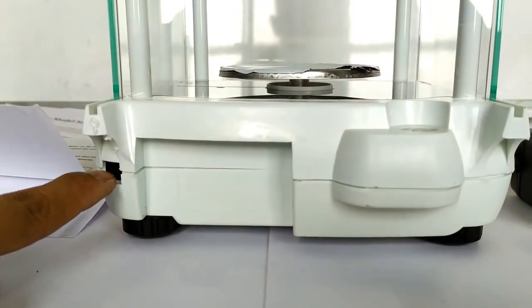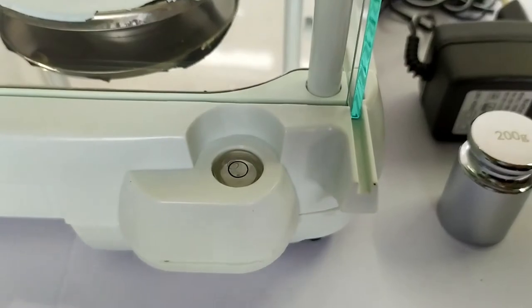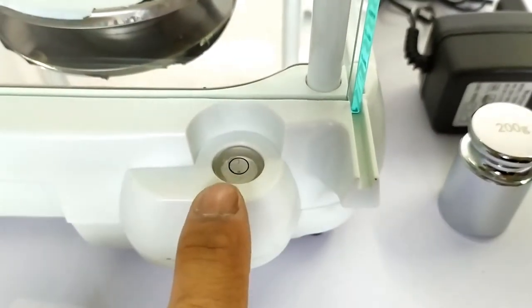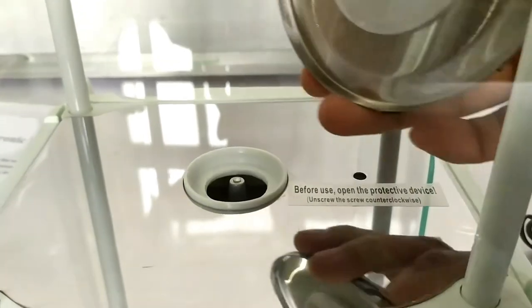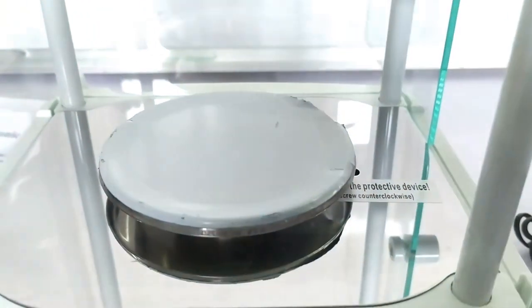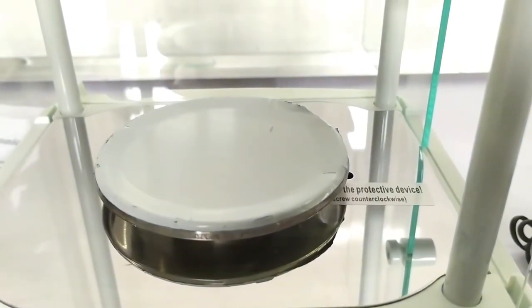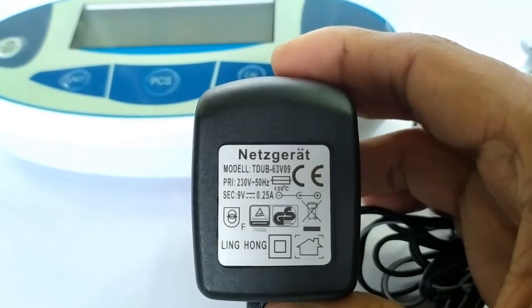Moving on, here is the power port at the back. And here is the liquid leveling gauge which I'll come to a bit later. And here is the weighing pan rest onto which the weighing pan sits perfectly. A close up of the power adapter.